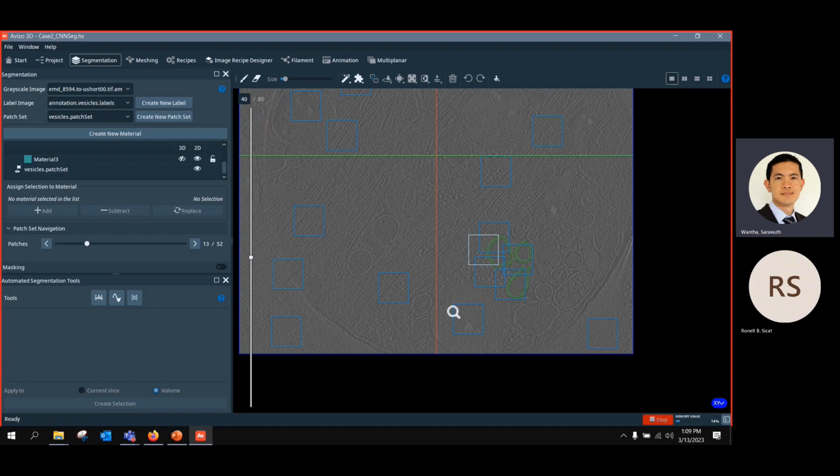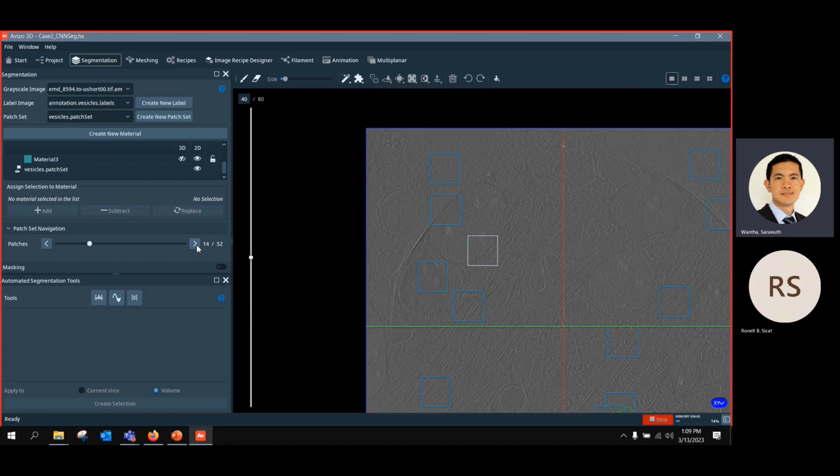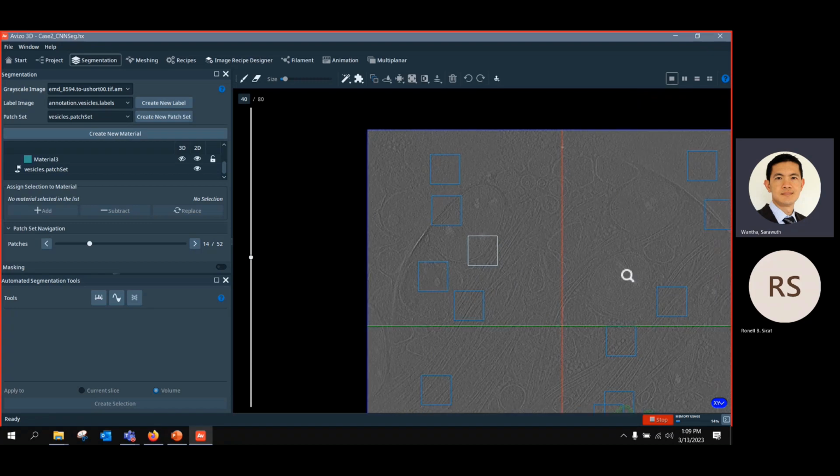That's why my result initially was not good enough, but you can see here there is a lot of background. That's why you should put effort on painting and put more background as well to distinguish the different membranes from different structures. Like here, you see they also have this patch with the membrane of the mitochondria. That's why you get better results.